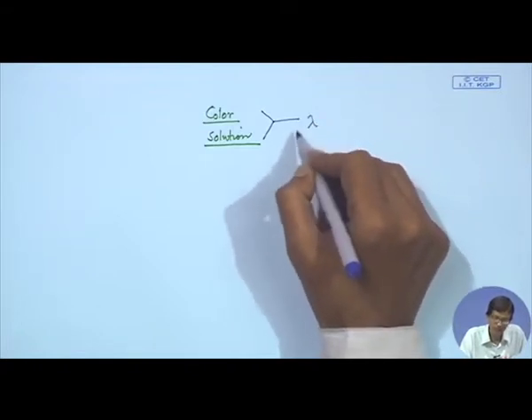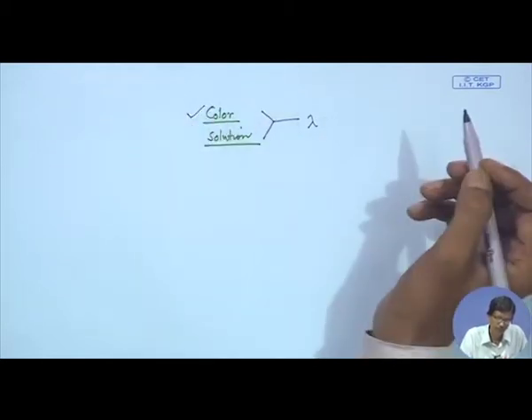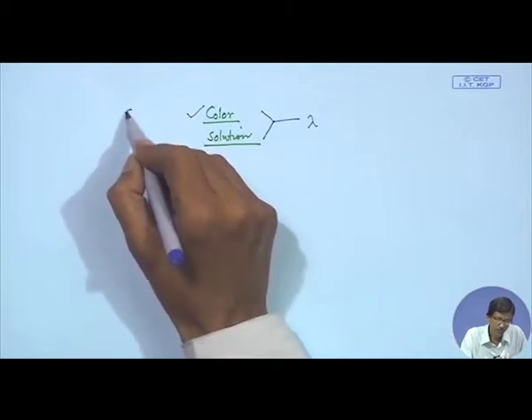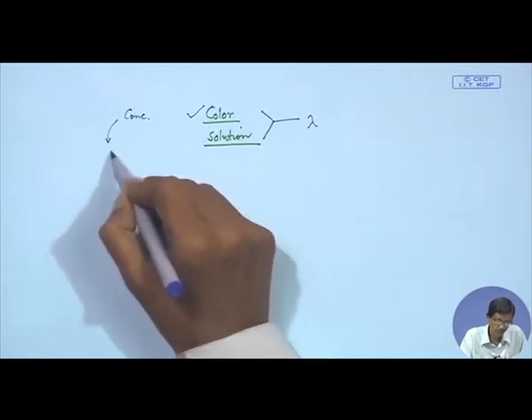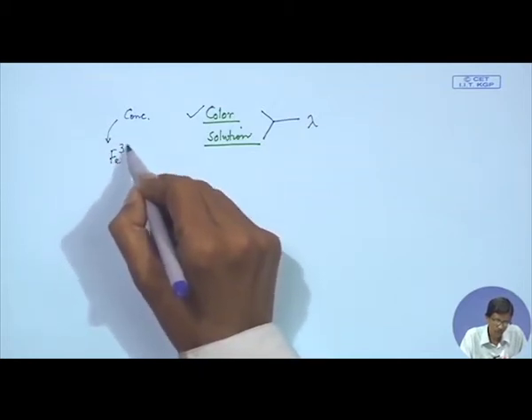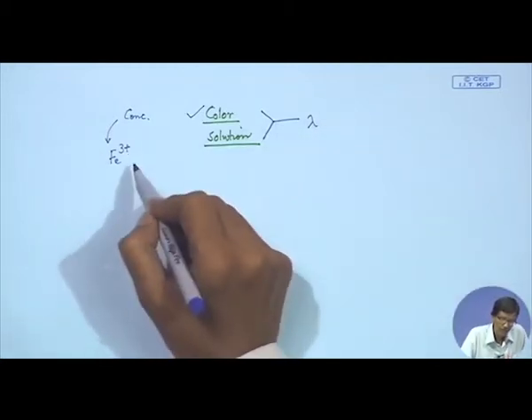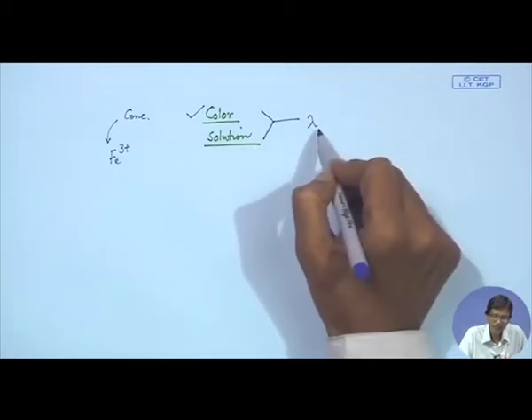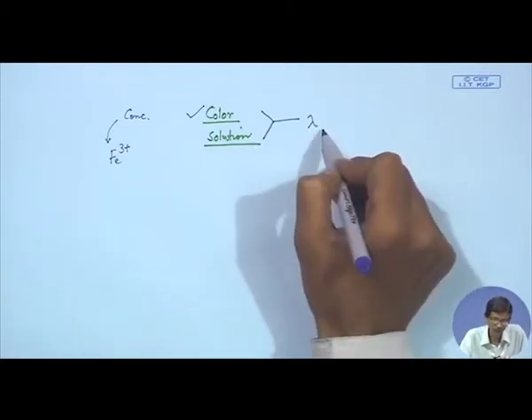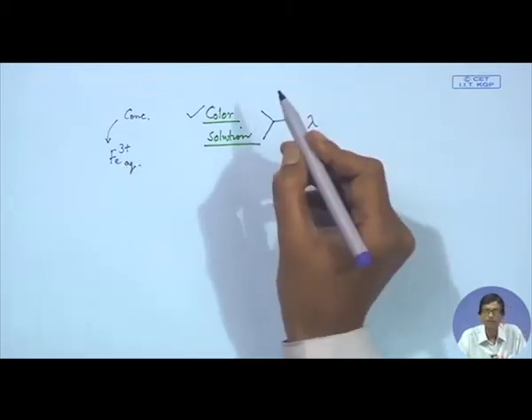But if a solution develops a color for a particular concentration of something, like the ferric ion, which we all know is yellow to orange depending upon the concentration, it can be very light yellow only, which is very difficult to detect by determination of the lambda value of that aqueous solution of Fe3 plus.